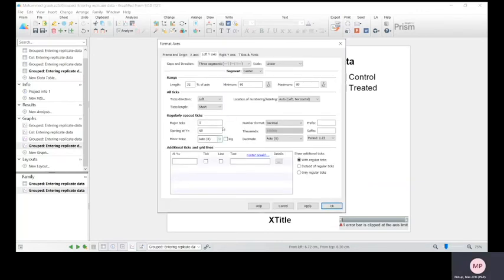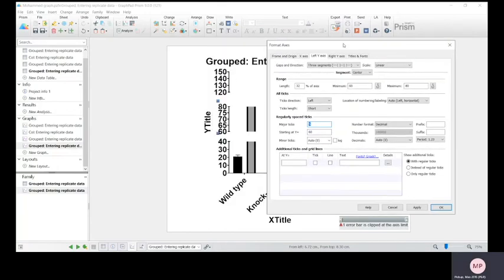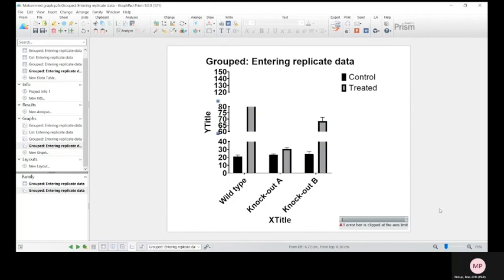How often the data comes up on the graph. So we want every 10, for example. Looks still a little bit nicer, okay.